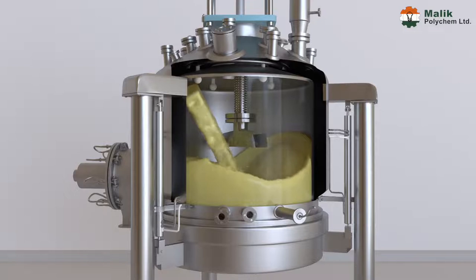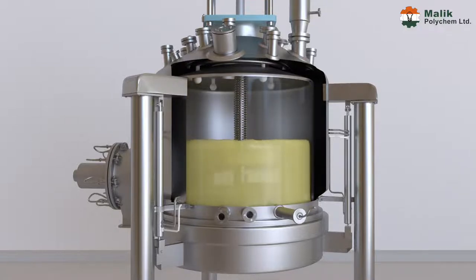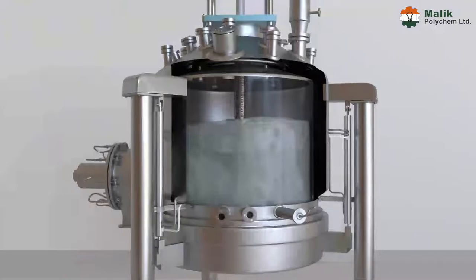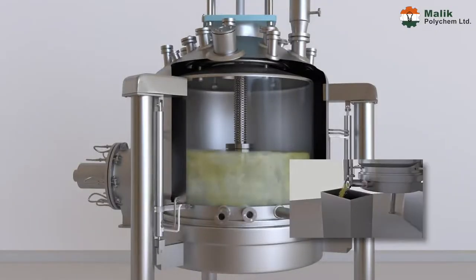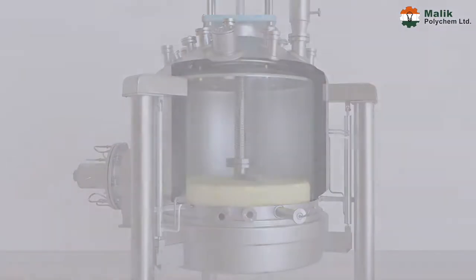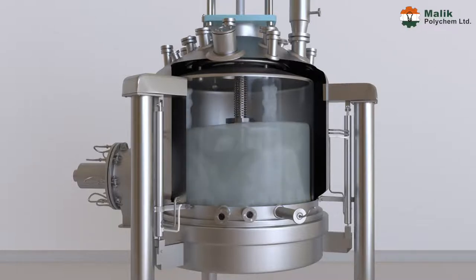First stage — charging: initially slurry is charged into the vessel, after which mother liquor starts passing through the filter cloth by gravity. Thereafter the agitator is started in a clockwise direction and slowly brought down by the hydraulic system, which deliquors the slurry and removes mother liquor from it.